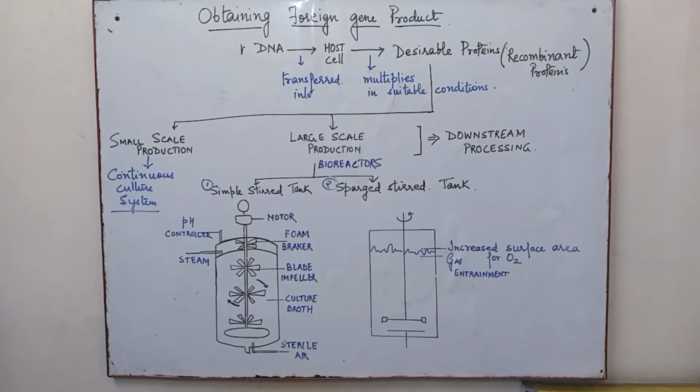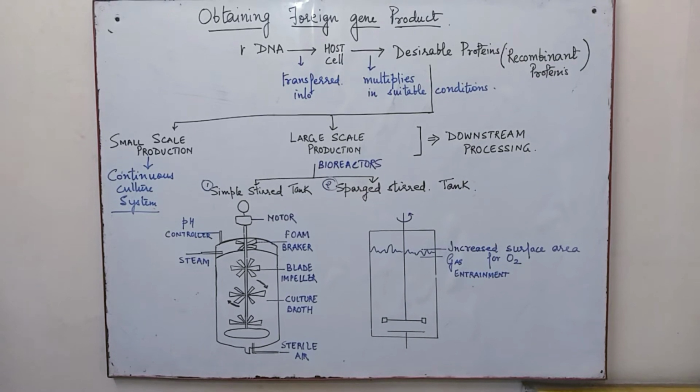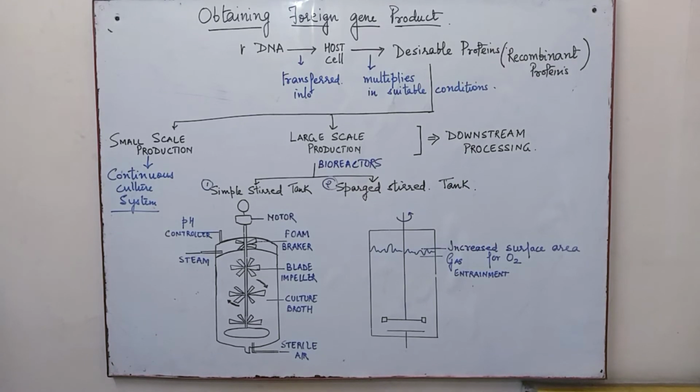Now when we talk of bioreactors, as the name suggests, you are providing suitable or ambient conditions for the living organisms to grow. That is, bio is the living and making the reaction possible. That is the place. Bioreactors are large vessels in which around 100 to 1000 liters of material can be converted biologically.